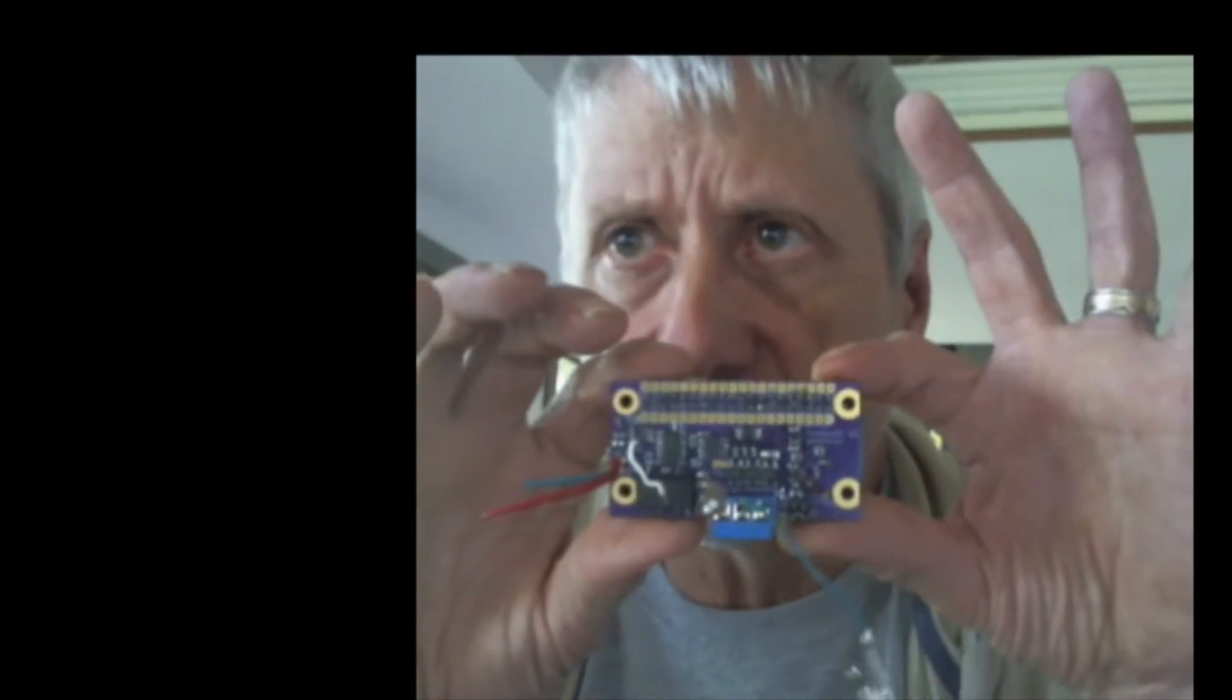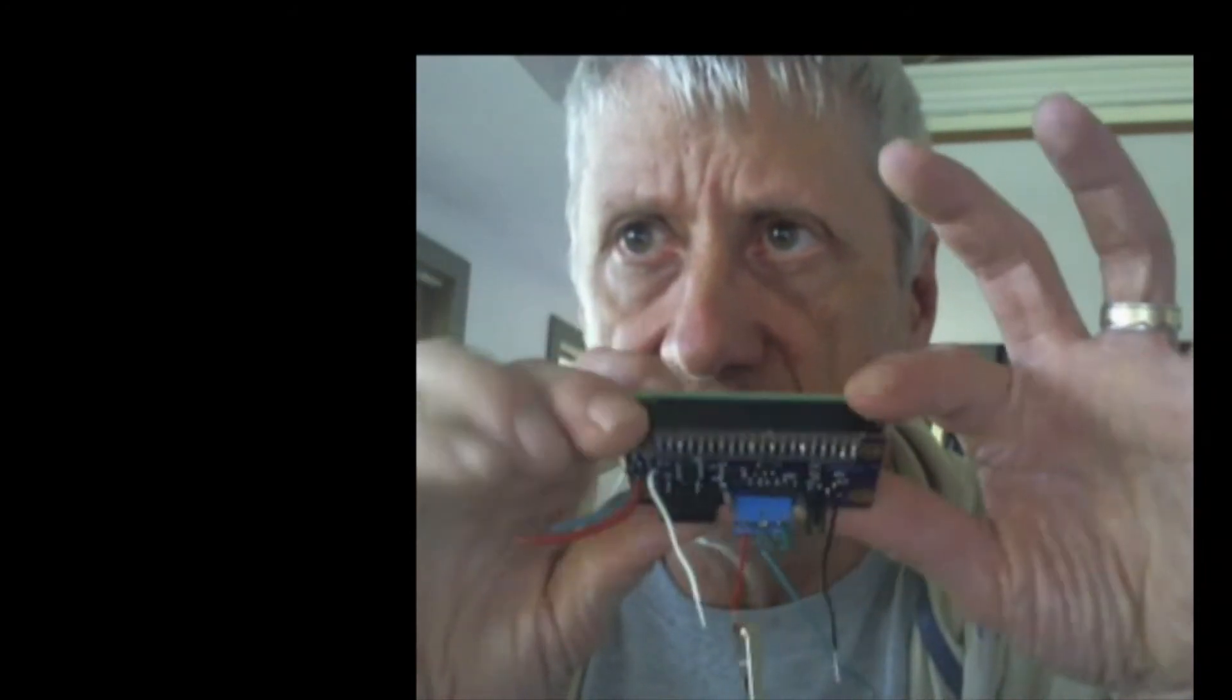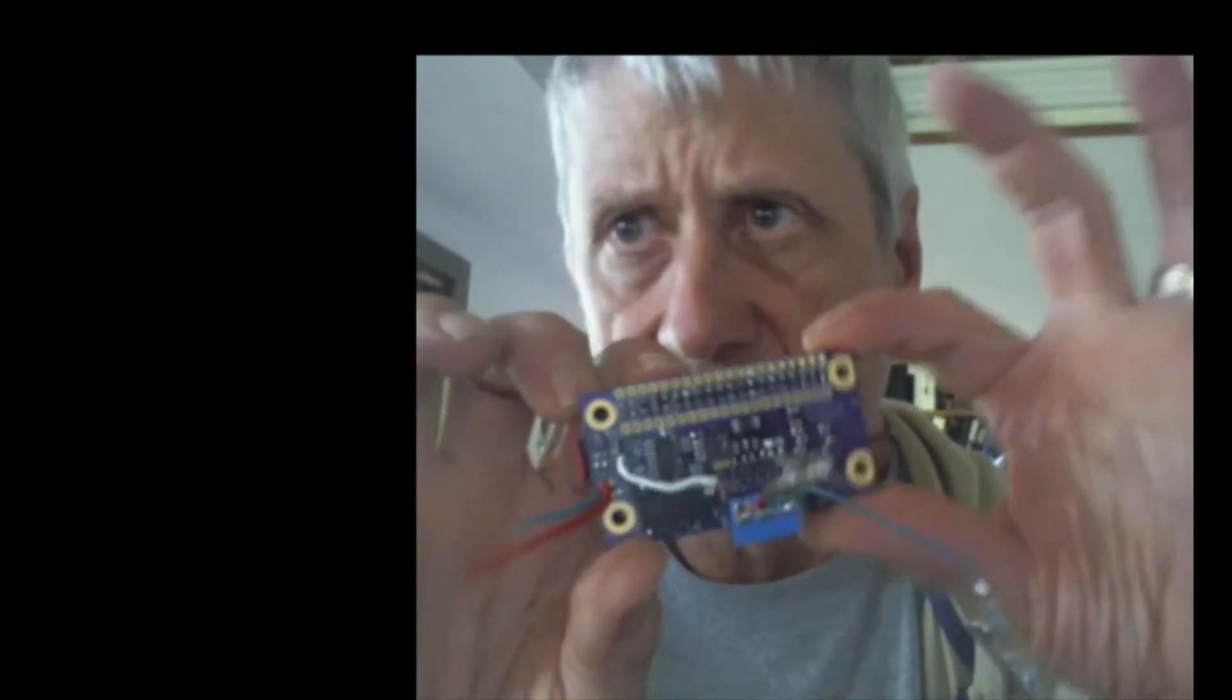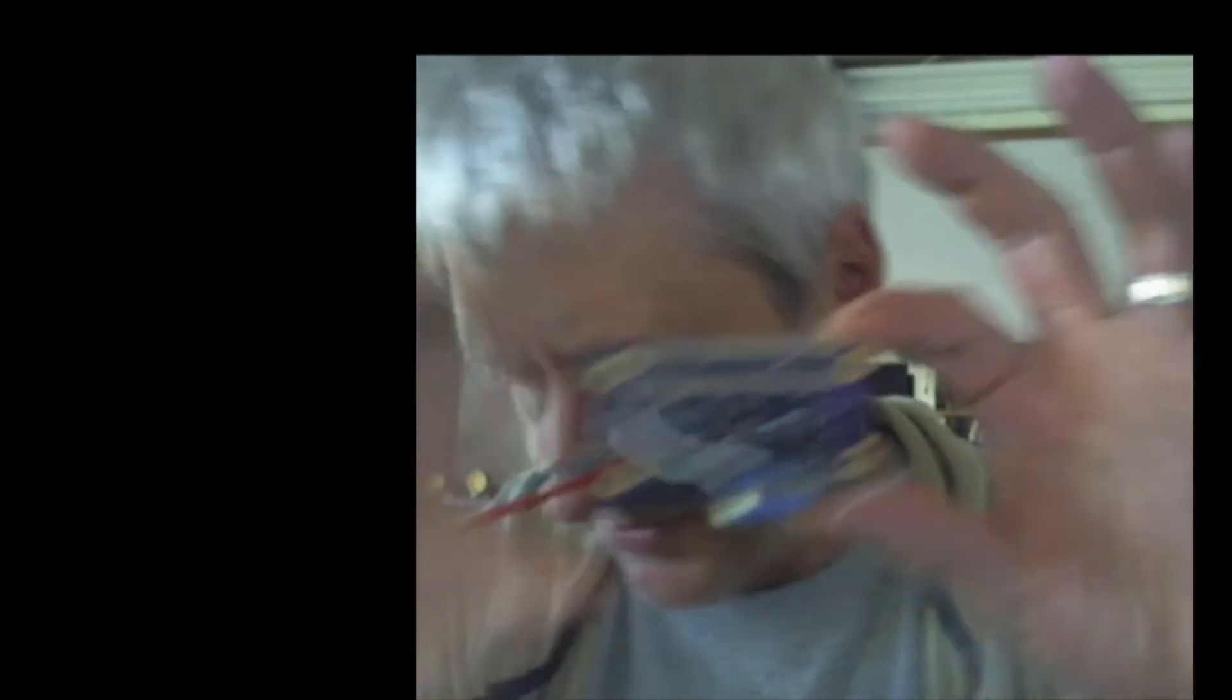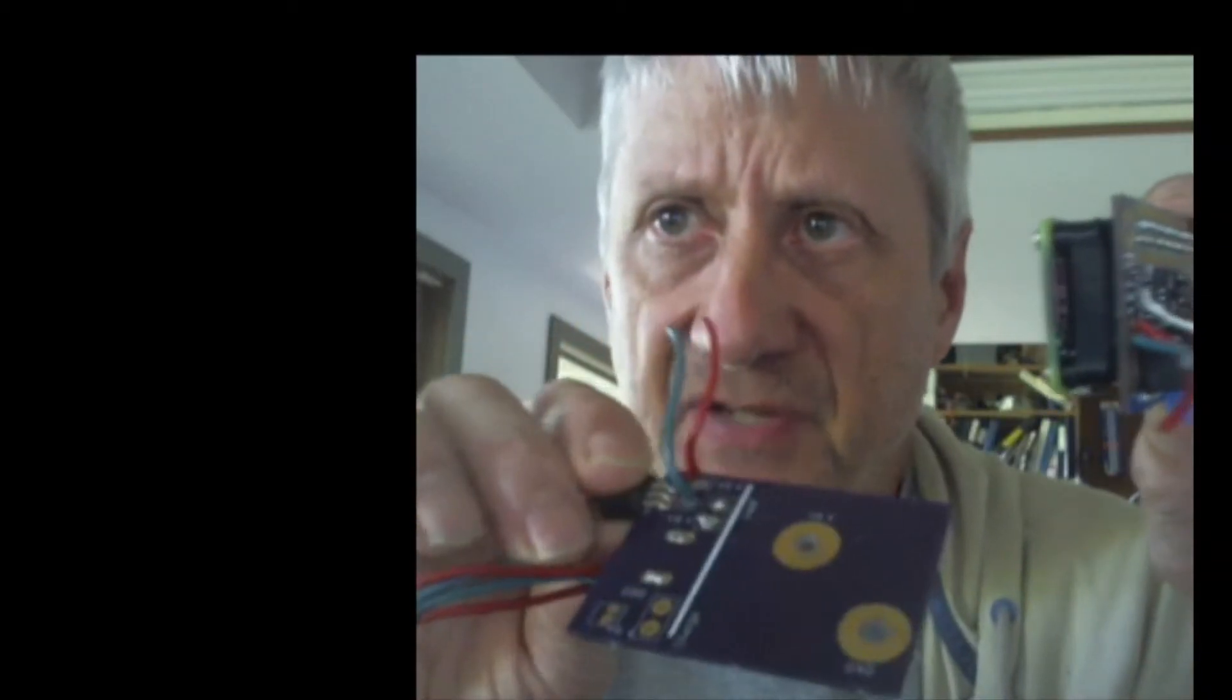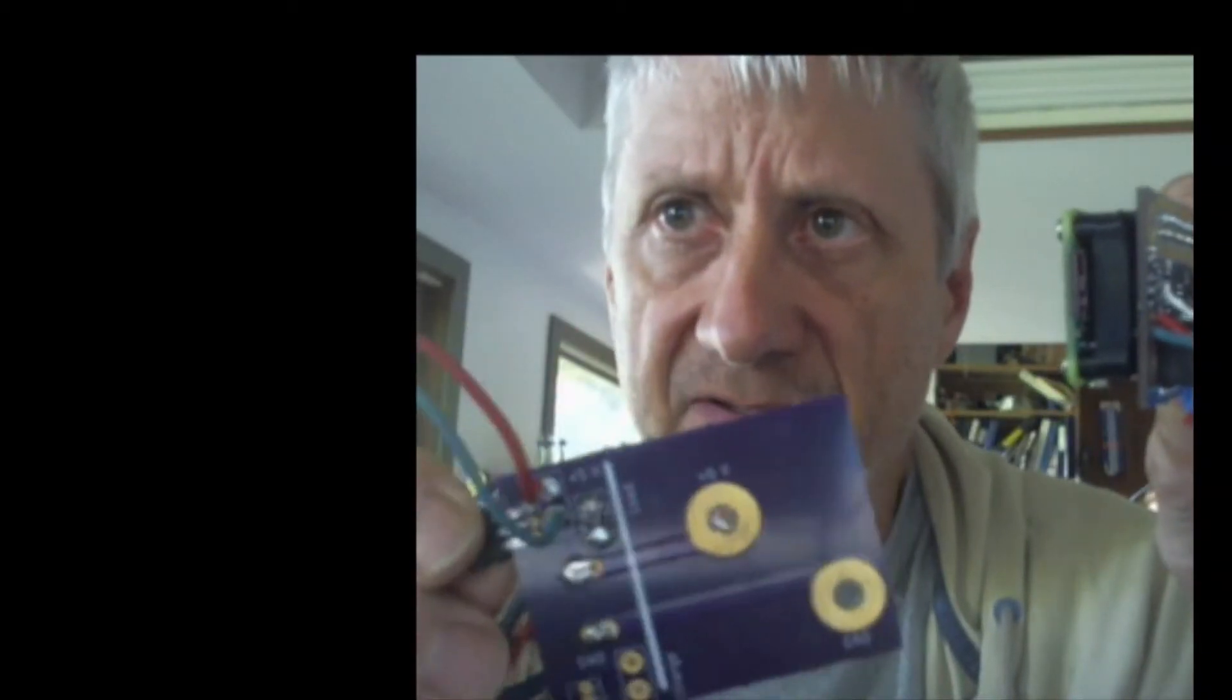And this is the hardware that I'm talking about. It's got two different boards on it. There's actually a third board, but that's still under development. This is going to be something like the power supply for the material when doing, for the instrument while it's under isolated from home electronics.